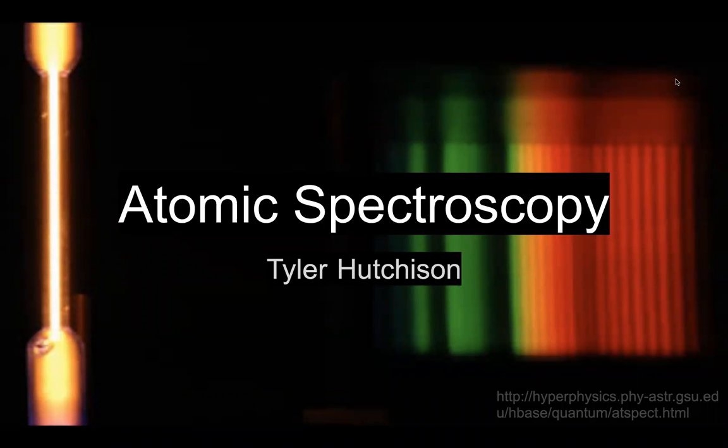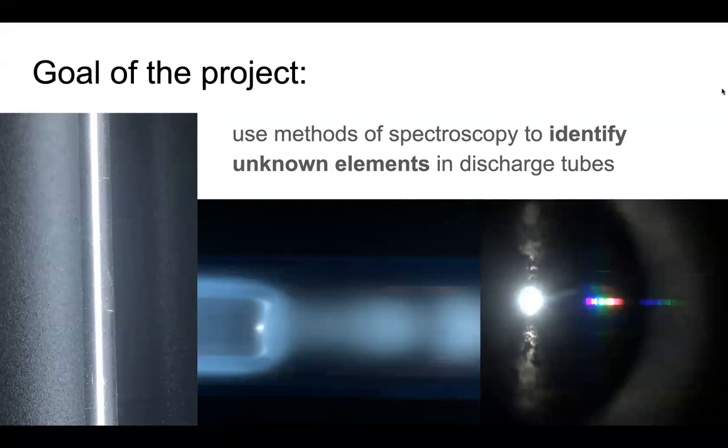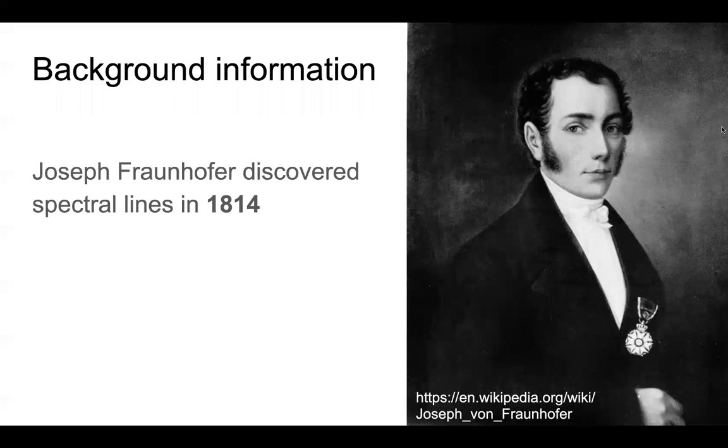All right, so this recording is my presentation for the final project, the atomic spectroscopy project. Let's go ahead and get started. So the goal of this project, of course, was to identify unknown elements in 8 different discharge tubes we were given. So a little bit of background.